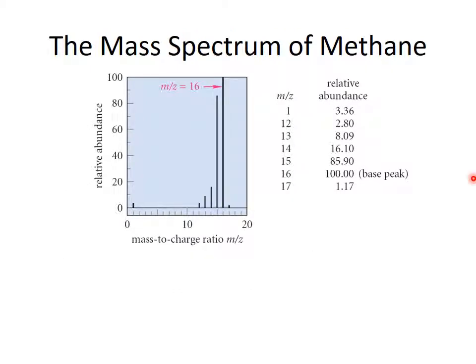Okay, so here is methane, and you can see that large peak for 16, and here's the loss of a proton, and then here's a loss of other hydrogens. There's a teeny tiny peak right there. Not a hydrogen free radical, hydrogen cation. It's usually not seen very much.